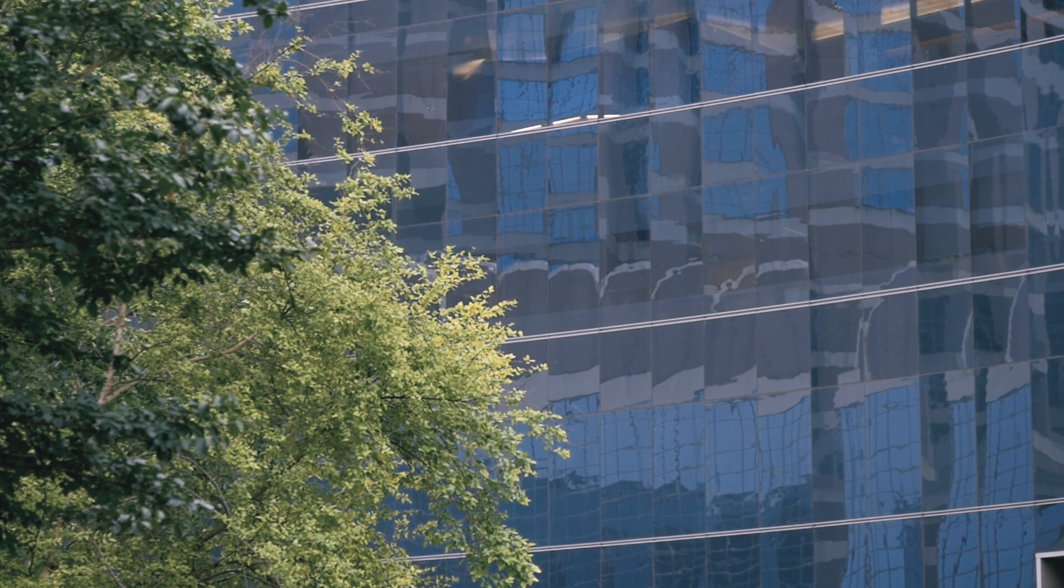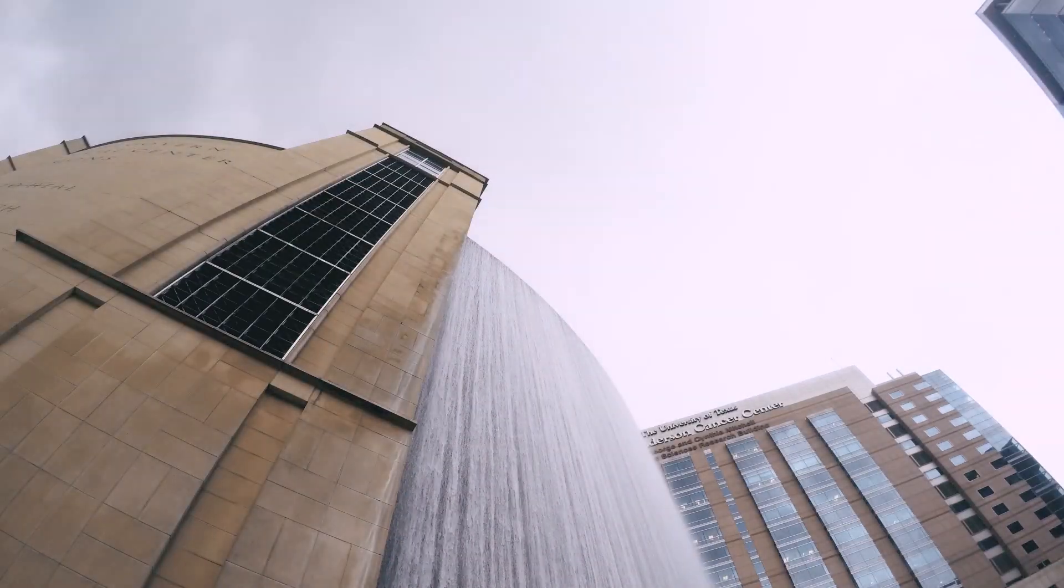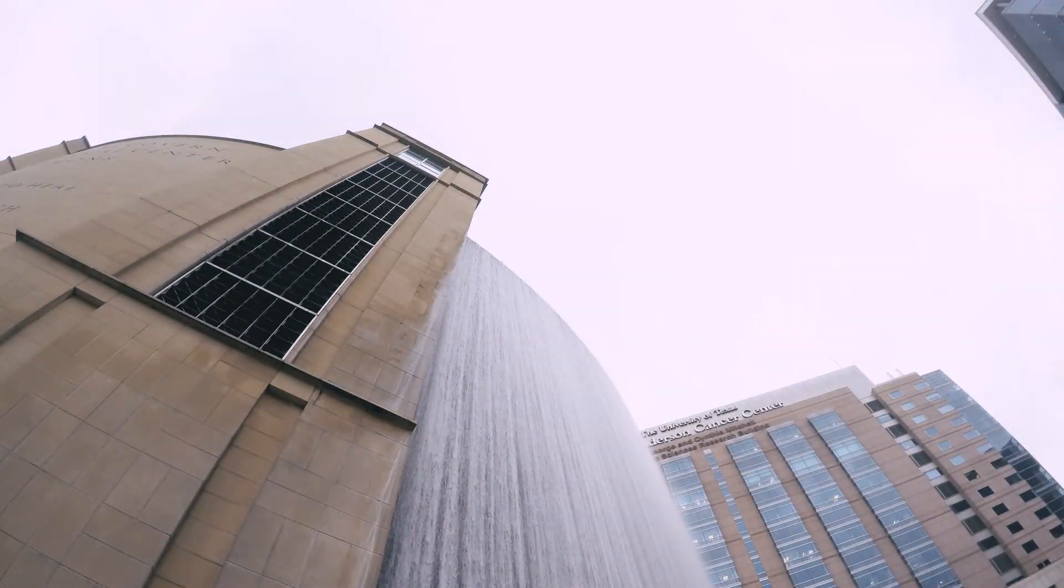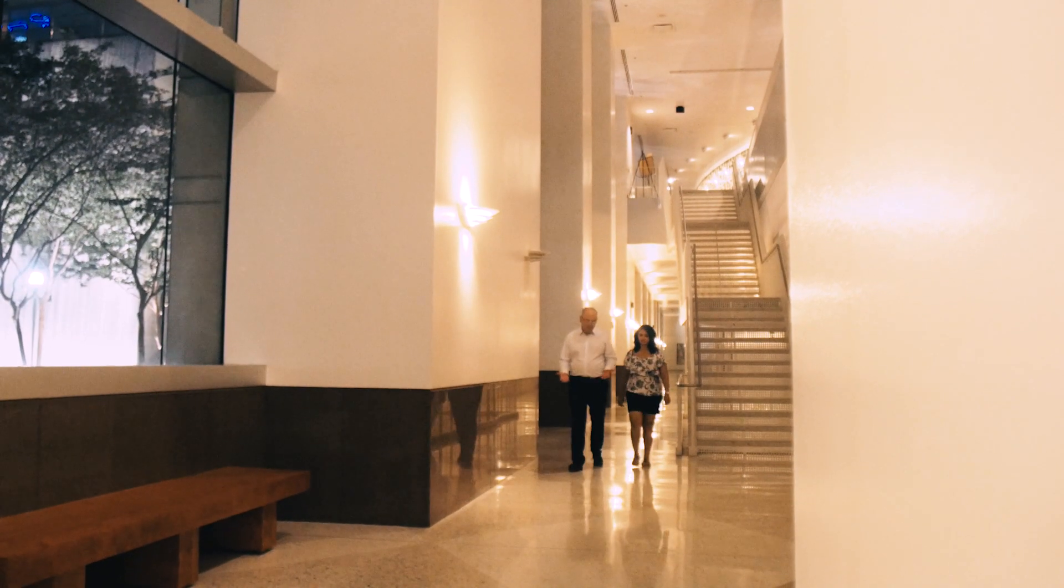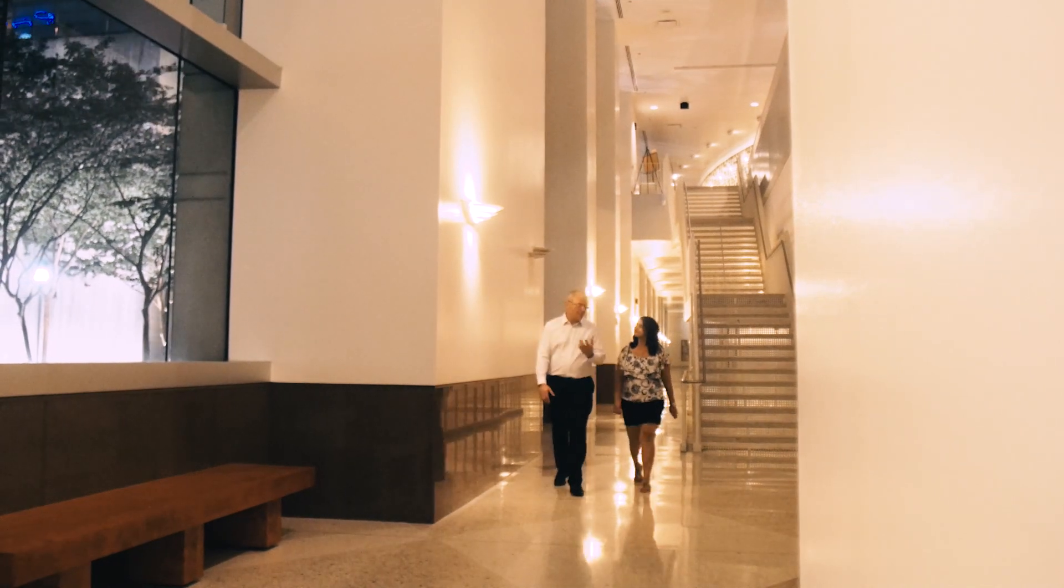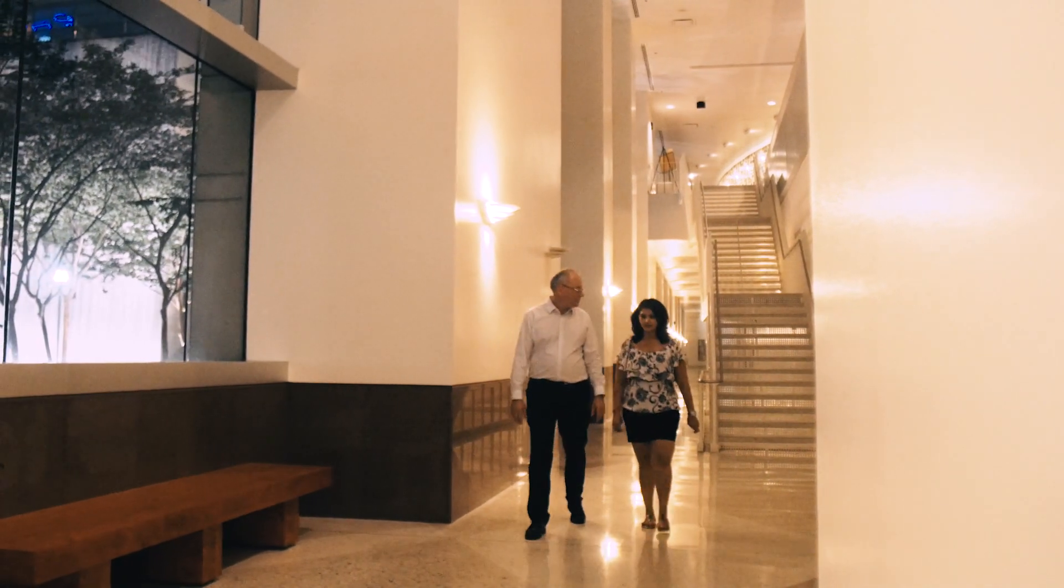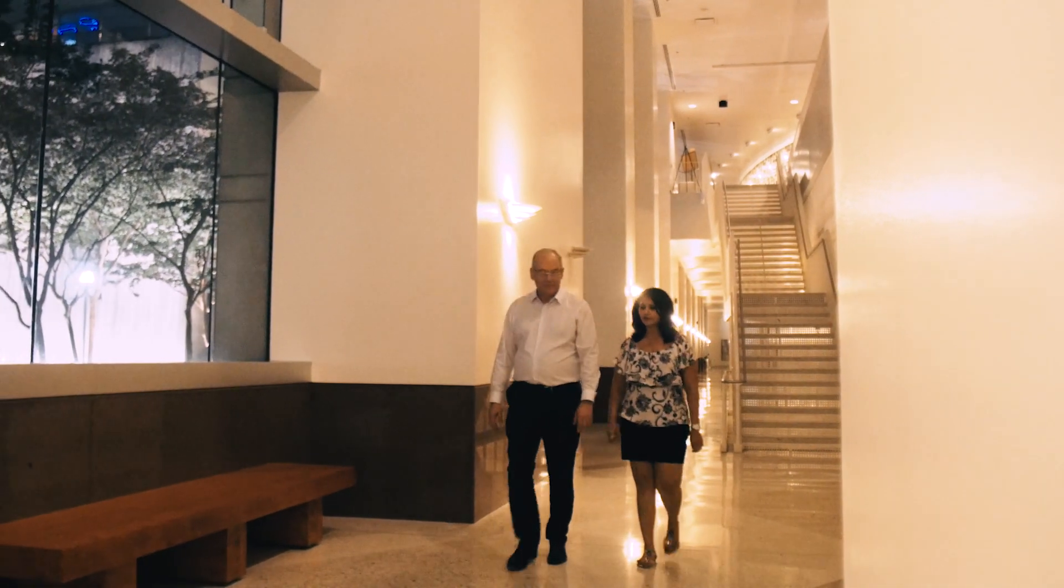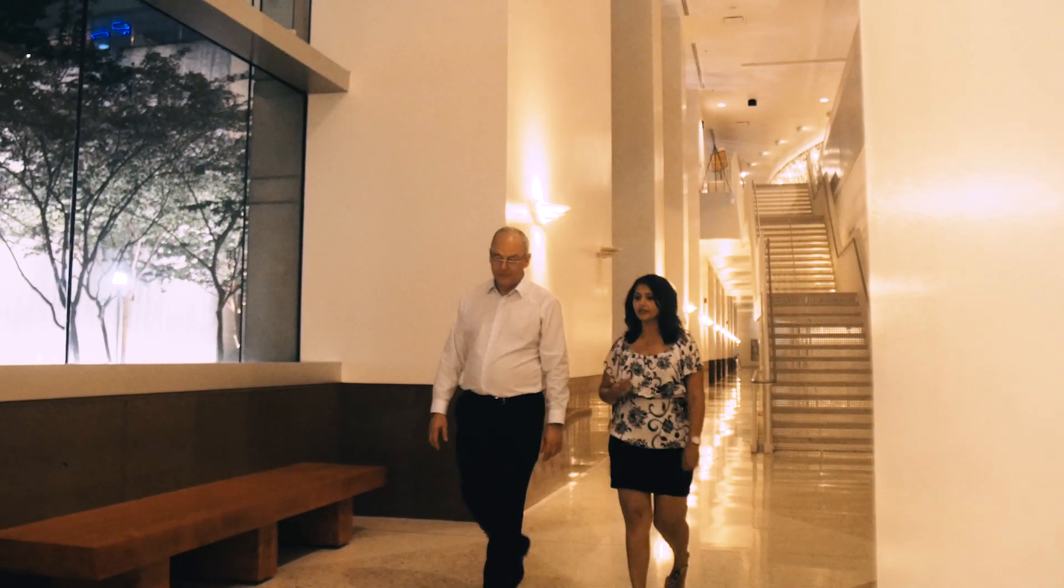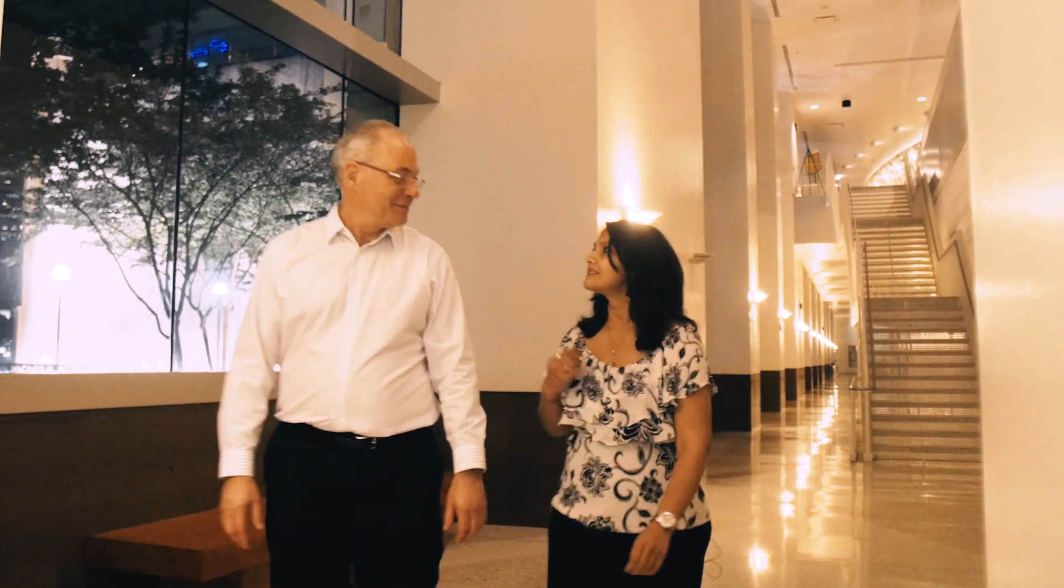This was an amazing day, wasn't it? Amazing facility. Single cell sequencing actually impacts every application you can think of. Yeah, absolutely. And we finally have a way to measure the very basic unit of life.